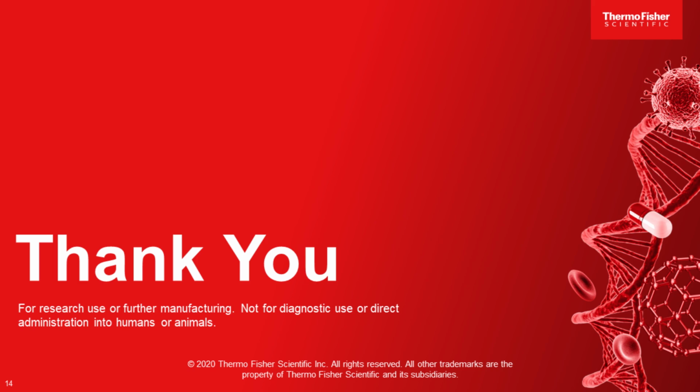All right, and our next question is, how do you convert copies to ng of ResDNA in dPCR? Yeah, so it depends on the assay, right, and on your target. If it's a single target, typically we recommend to go with a standard approach of what's the size of your genome, and then you get a copy of one, and then you multiply that with the size of the genome. It's kind of like the worst case approach, but a simple one because once established for that cell line, right, you can use that conversion factor, mathematical conversion factor.